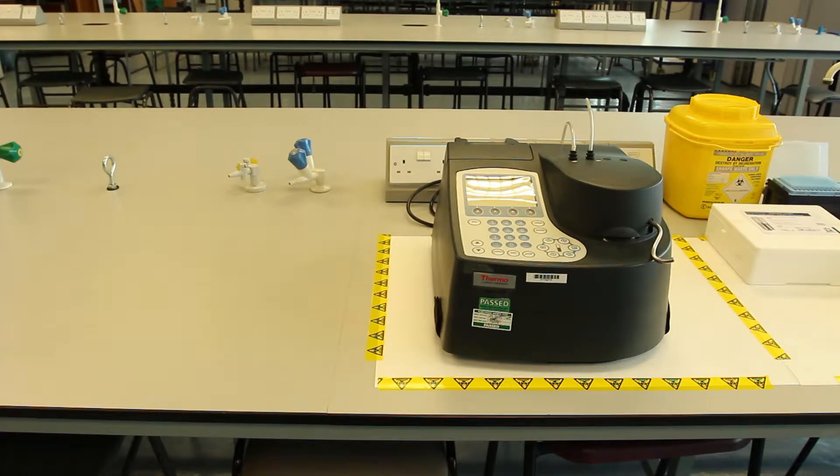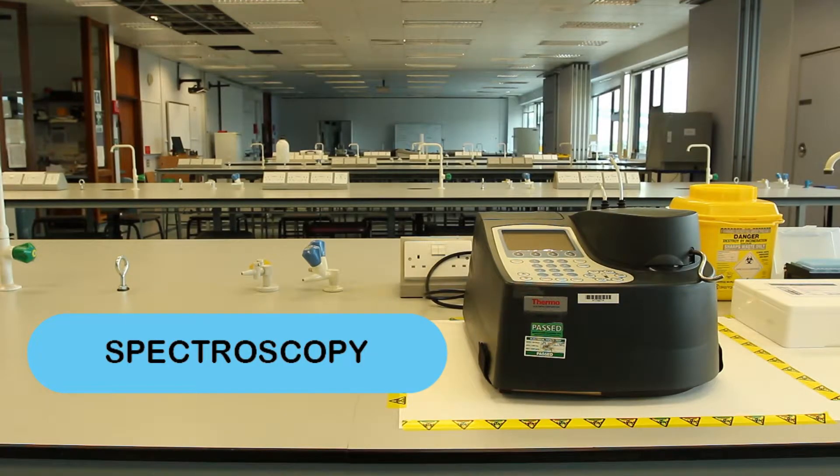The science behind how this instrument works is called spectroscopy, which is the study of the interaction between matter and the electromagnetic spectrum.